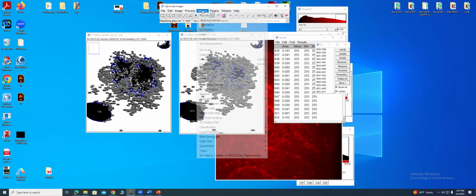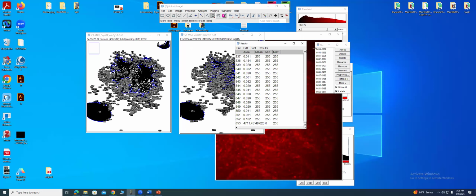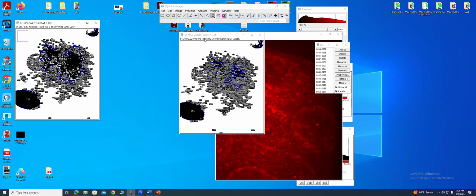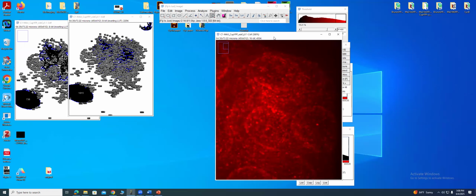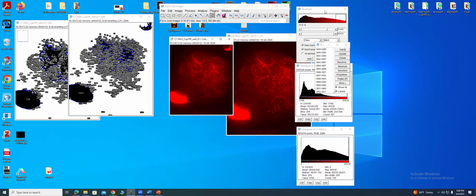Okay, so again, you can just, oh, I just did measure again. So the total volume here is this. So it gives you an area. Sorry, let me move this. Okay, sorry, let me just clear this out. Don't save. And let me go here. And let's do this thresholding.